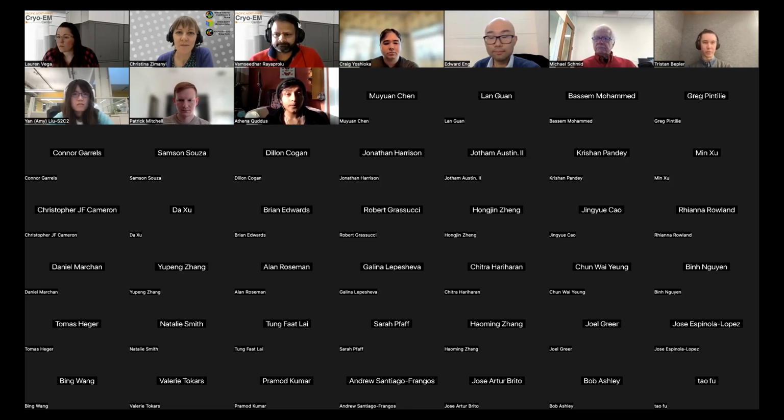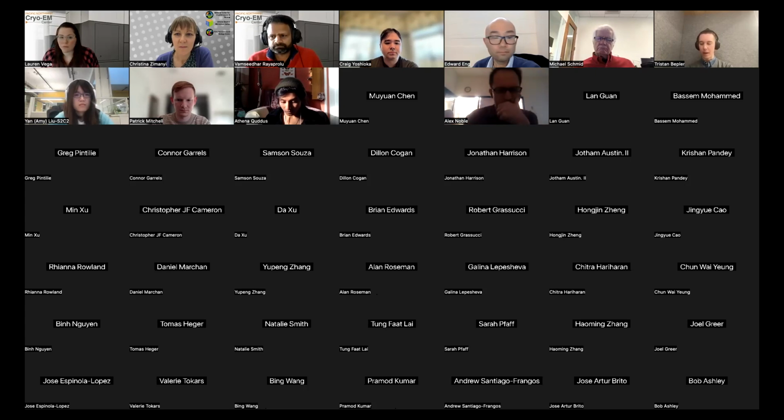I do think most people use Topaz now through the CryoSPARC or Relion plugin integration, as far as I can tell, but it is 100% entirely standalone. The drawback of the standalone version of Topaz is there's no GUI. Okay, there's a rudimentary GUI, but it's primarily command line. So there are instructions if you go to the Topaz GitHub and look at the README. And we also have a brief tutorial there on using the Topaz command line tools to run Topaz. And there is also a bare bones GUI there, which is basically a web-based GUI, mostly just to help you label particles. It doesn't actually run it for you.